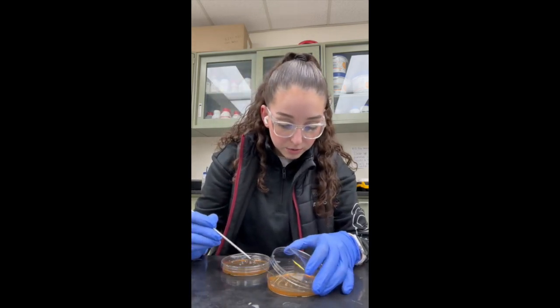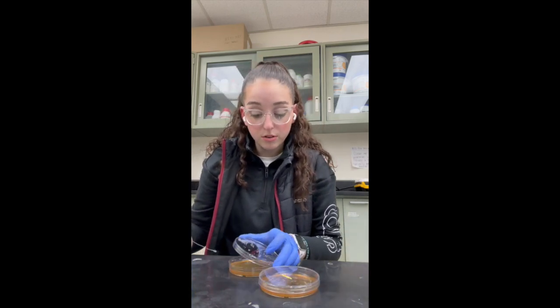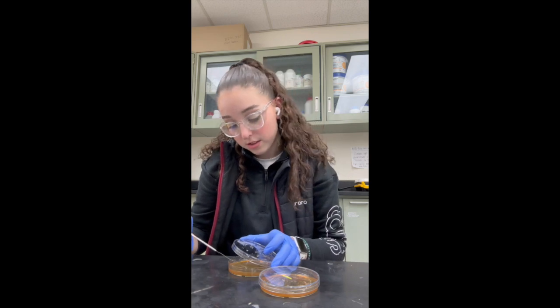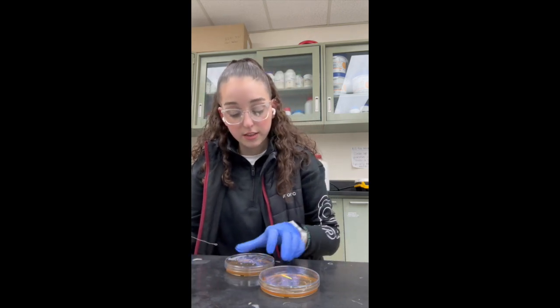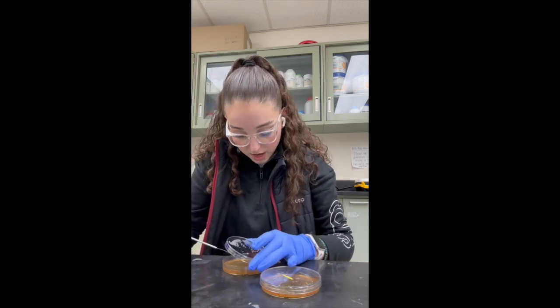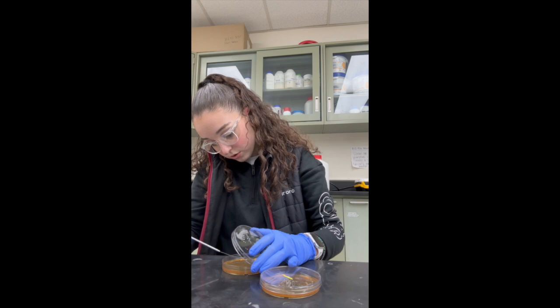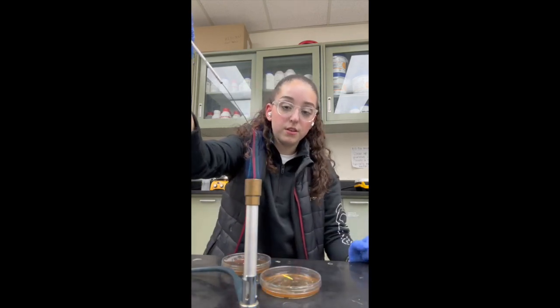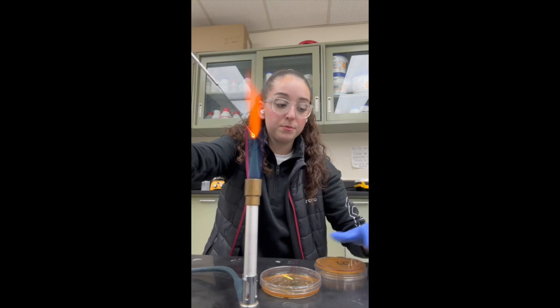I'm going to grab a little bit of my sample, put it on the sample spot, and streak it back and forth evenly. Then I can take the same exact sample and put it on my unknown A control. And then I will flame the loop to clean it off. I'm going to do the opposite so I don't contaminate my alpha.